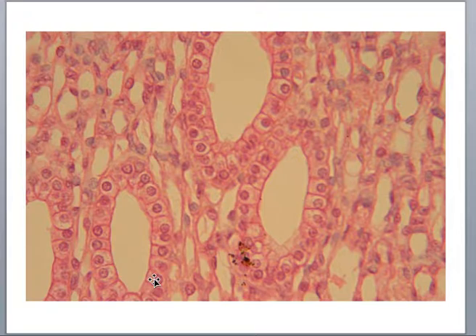If you look at glands, so exocrine glands, things that secrete substances to the outside, sweat glands, sebaceous glands that produce oil to moisten our skin and hair, those exocrine glands you will find will look exactly like this. You'll see little tubules and simple cuboidal cells lining those tubules because they're secreting a substance into this lumen to be directed to the outside.